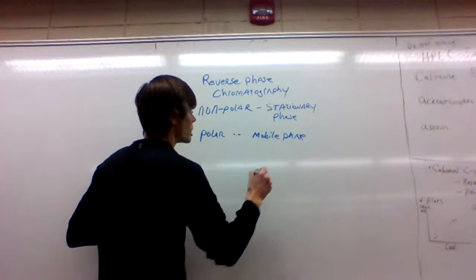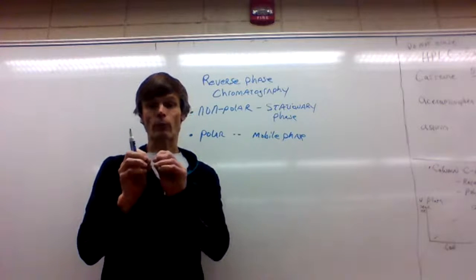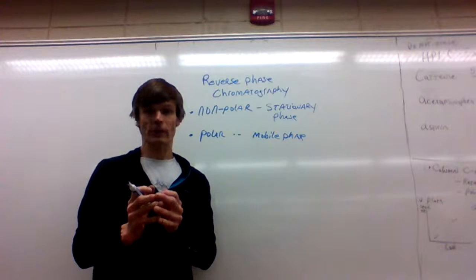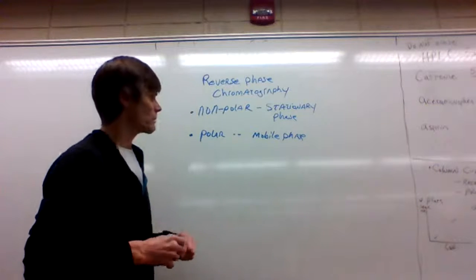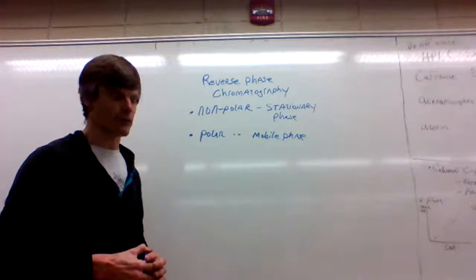So, a non-polar stationary phase is going to be really amenable to retaining non-polar substances. So we're going to expect those to come out later, and our polar guys are going to come out really quick because they don't want to stick to the non-polar stationary phase.